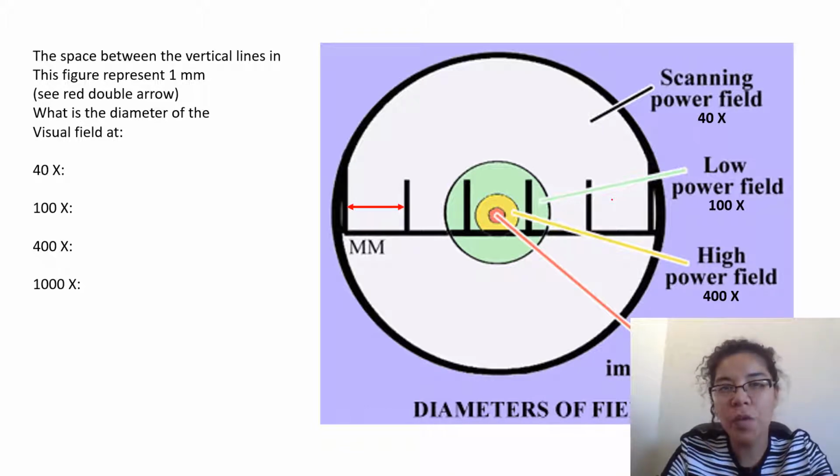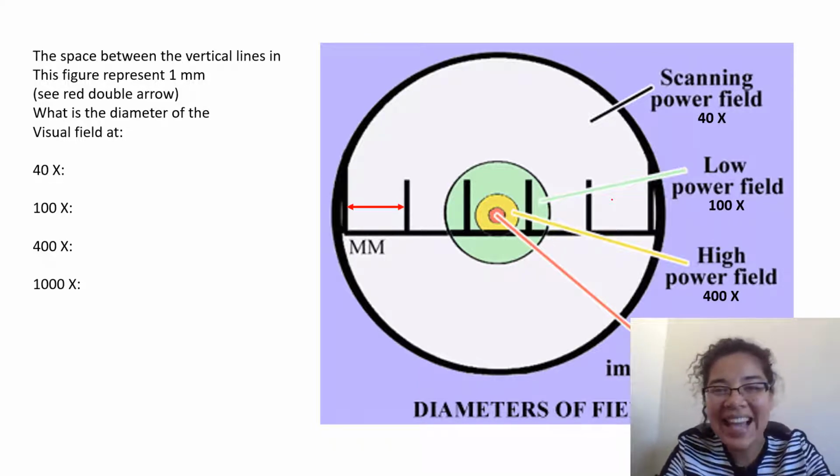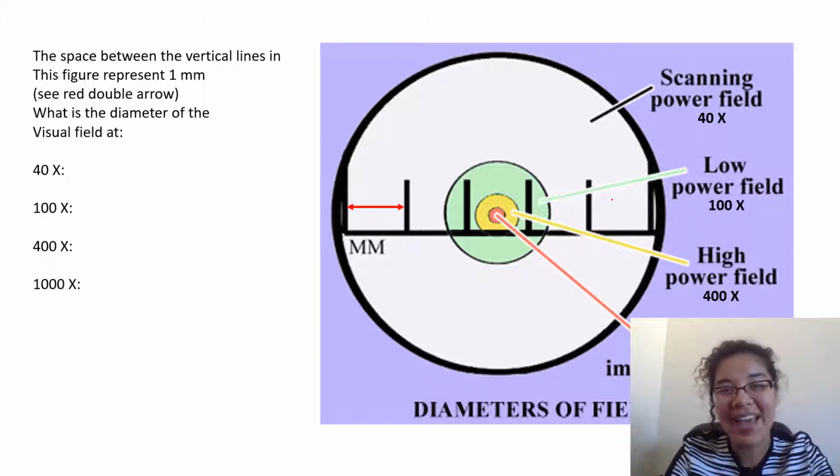We go to this field that shows you measurements. Normally in lab, we would literally put a little tiny ruler on a slide, look at it under the microscope, and measure that field, that circle that you see under the microscope. We're not in lab, so we gave you that image here with labels.